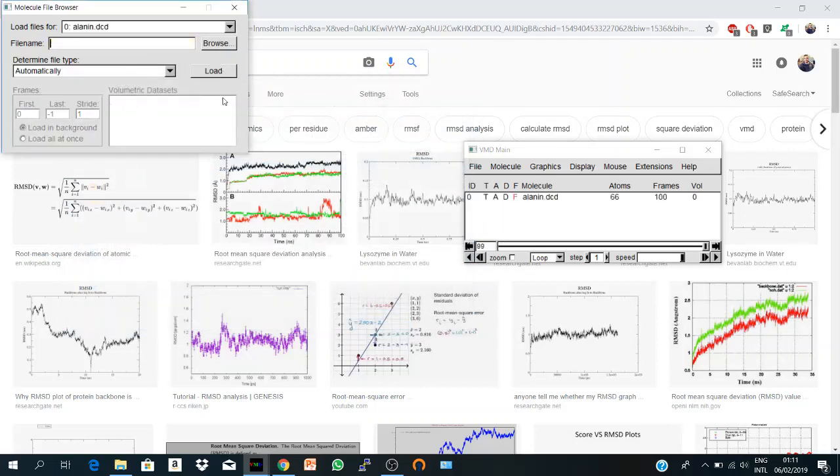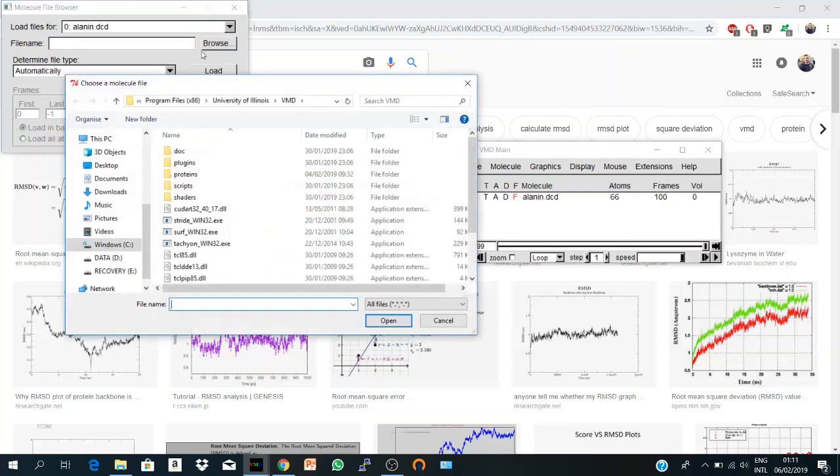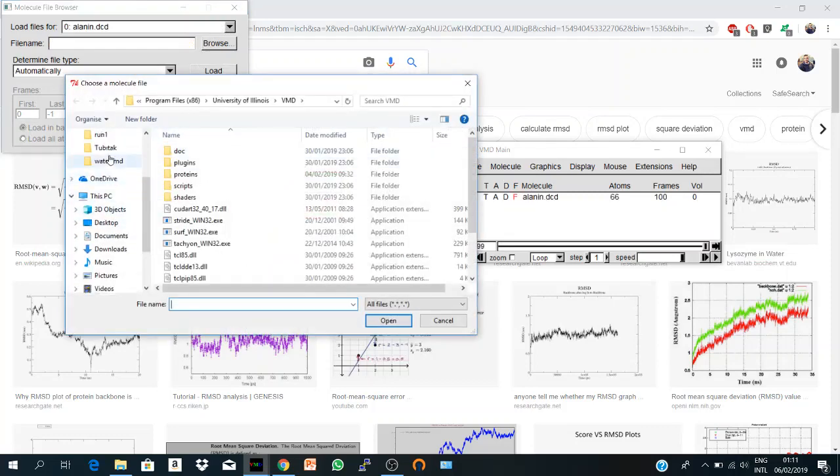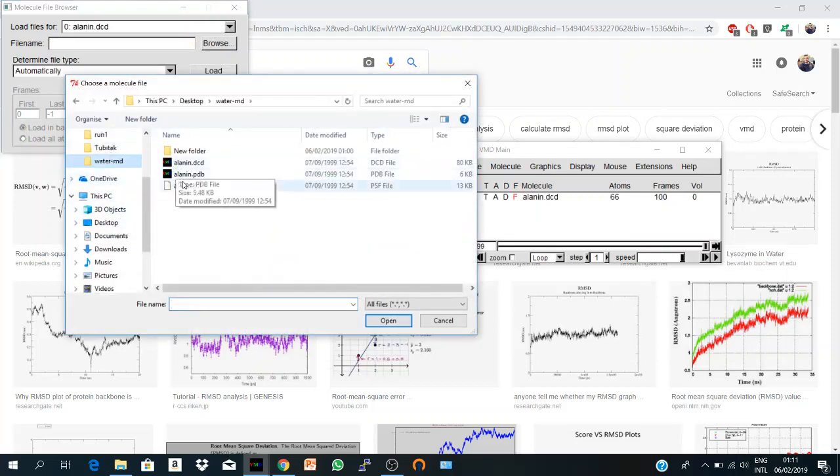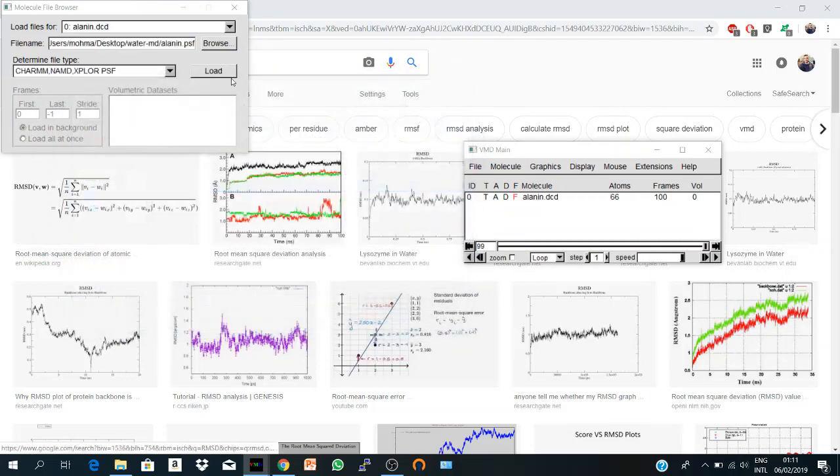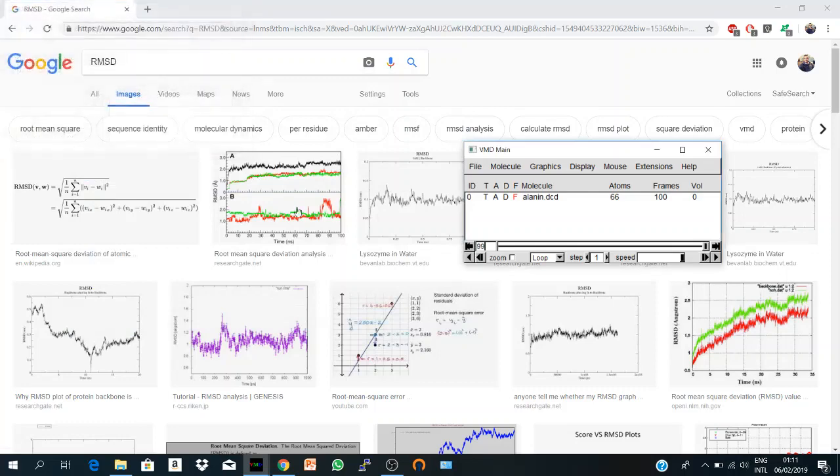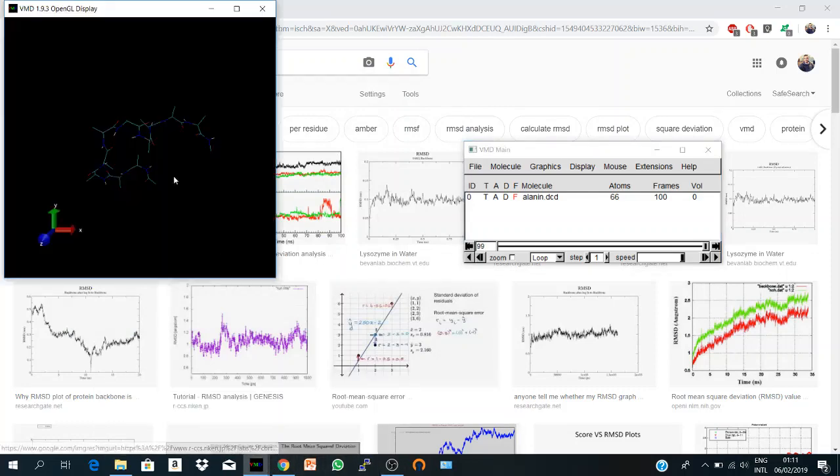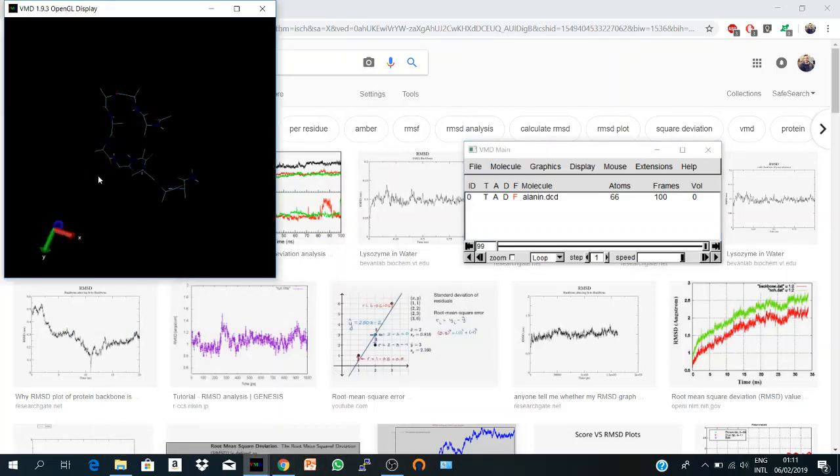And I give the PSF file of this simulation, alanine.psf. Now VMD knows the structural information and you can see your molecule.